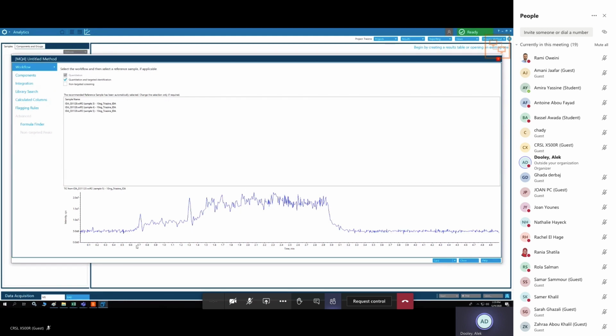The first step here presents to you all of the samples that you added, and it asks you to choose a reference sample. The reference sample will be what is integrated in the method steps here, and it will be what is used to build the model that sits with your method. It is not actually the integration of that sample. That will happen in the next step when we actually do the processing. However, as it is the model or the reference sample, we do want to make sure that we choose a sample that has all of the compounds in it that we want to identify, or if you're doing unknown work, that it is as close to your real sample as you can imagine.